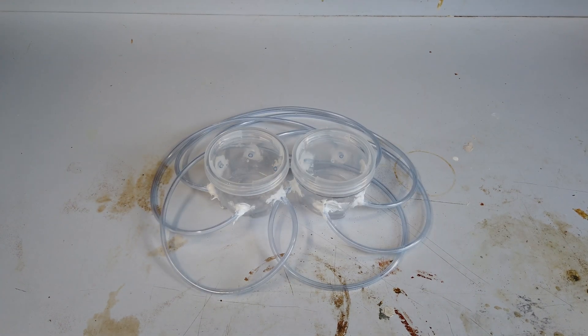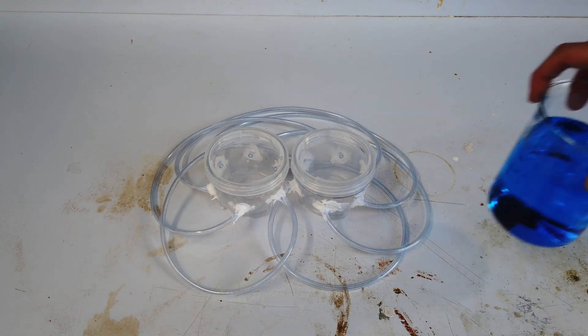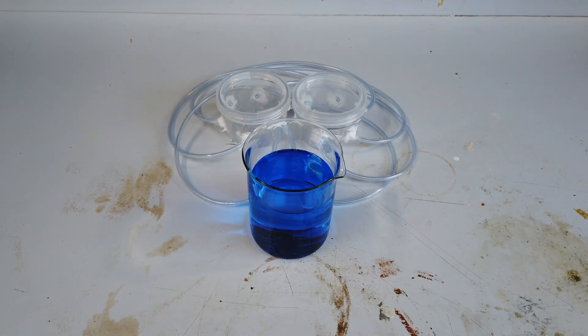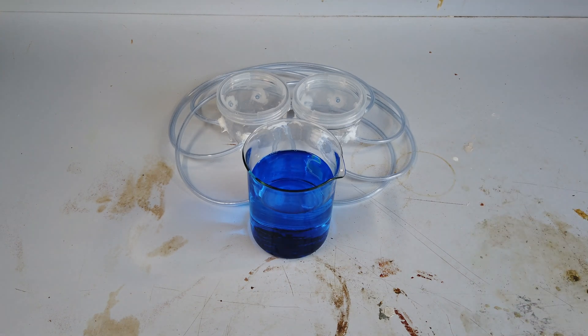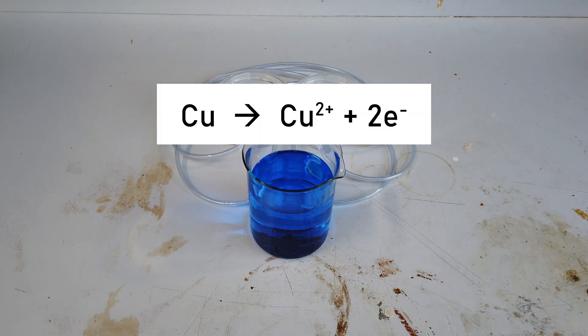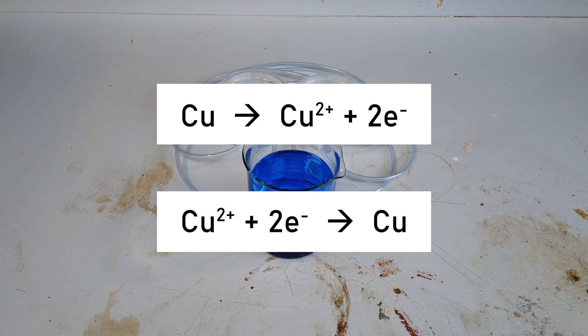Our experiment will basically just involve the electrolysis of a copper sulfate solution with copper electrodes. This is a very common way to transfer copper from one electrode, the anode, to the other. It will oxidize on the anode to produce Cu²⁺ ions, and on the cathode Cu²⁺ ions will be reduced back to copper metal.